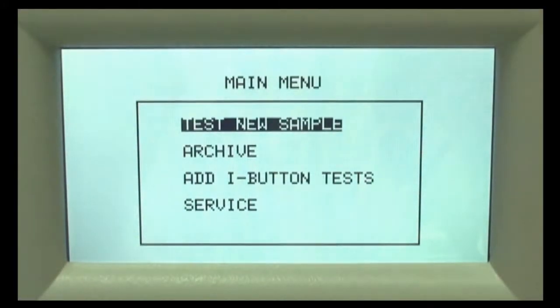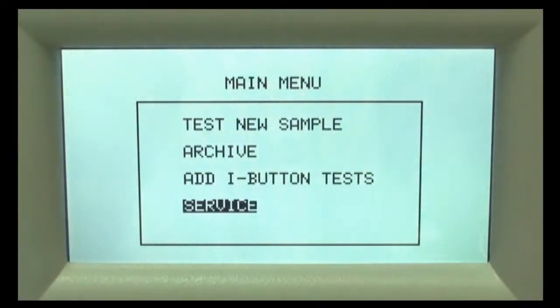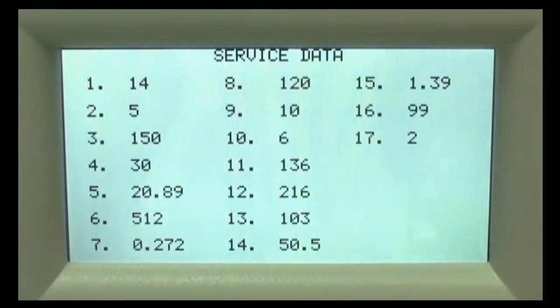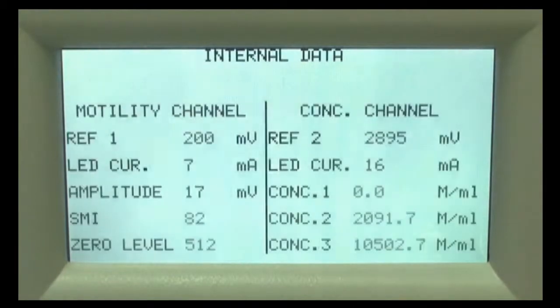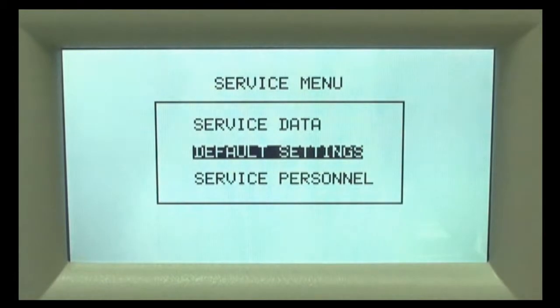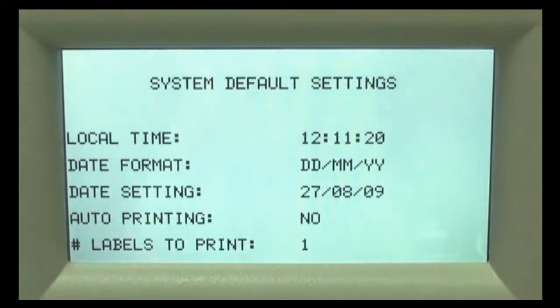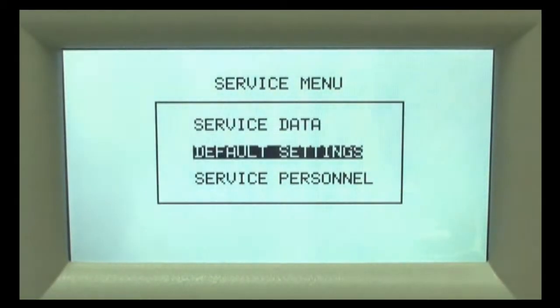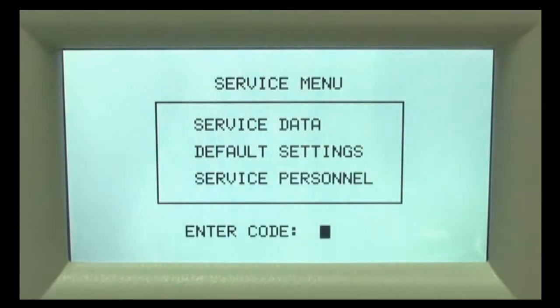The QwikCheck Gold service menu consists of 3 sections. The service data screen contains key system parameters that will assist your ATech rep with troubleshooting should the need arise. The default settings section allows you to set the time, date, and label printing options. In newer versions of the system, the default settings section will also include the option to switch between fresh and frozen samples. Lastly, you have a service personnel section, which is password protected and used by ATech wizards only.